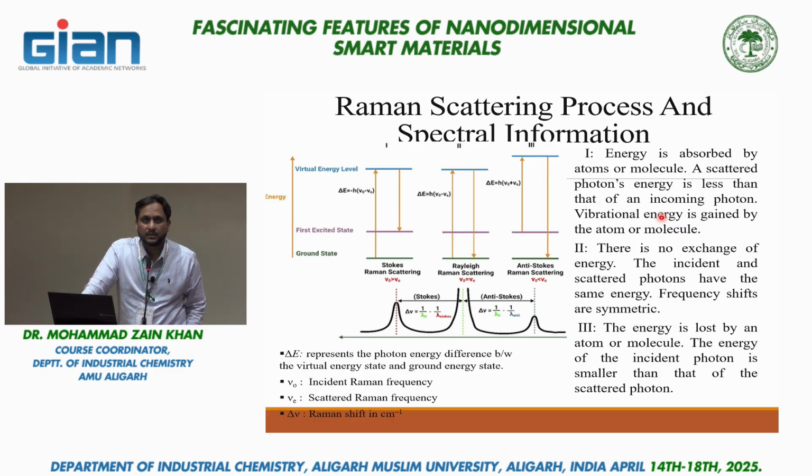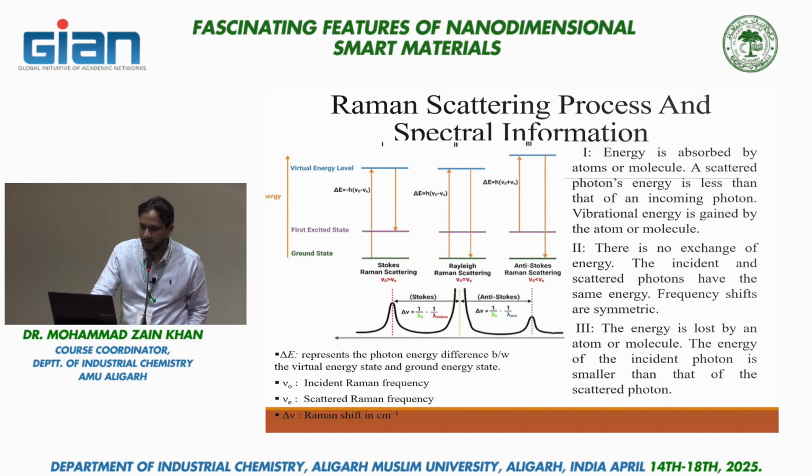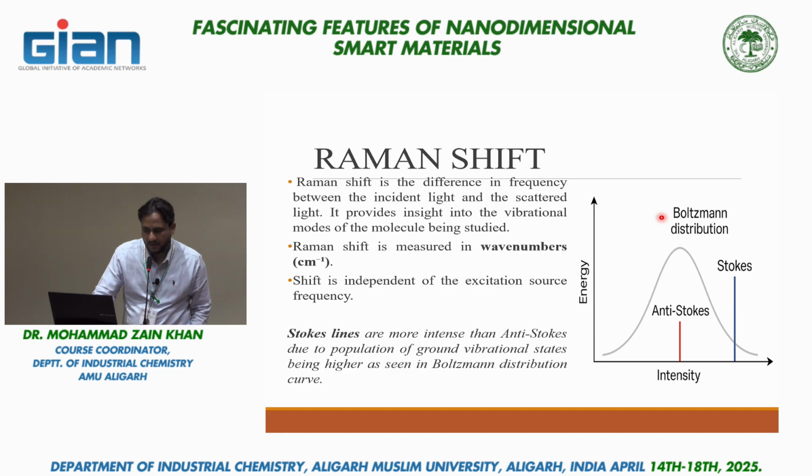Just by measuring the height of the D and G bands of the Raman spectrum, we can identify the defect density or the disorderness of graphene. So, by looking at the Raman spectrum, you may identify whether your graphene sheets have defects or not, and if there are defects, what is the density of those defects. So, it is one of the very good techniques for graphenes.